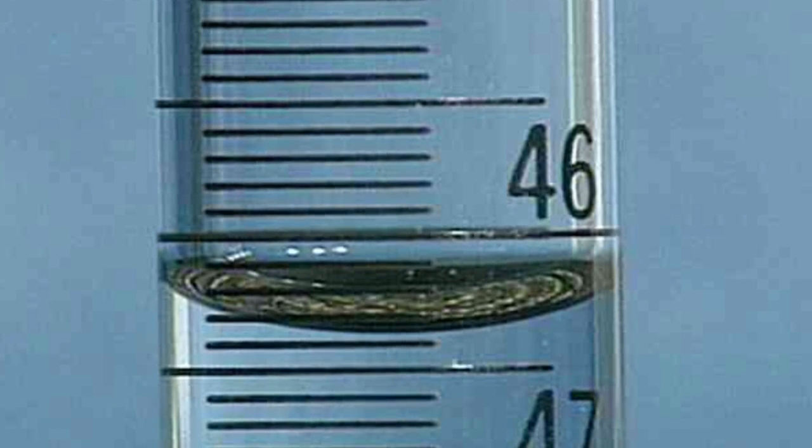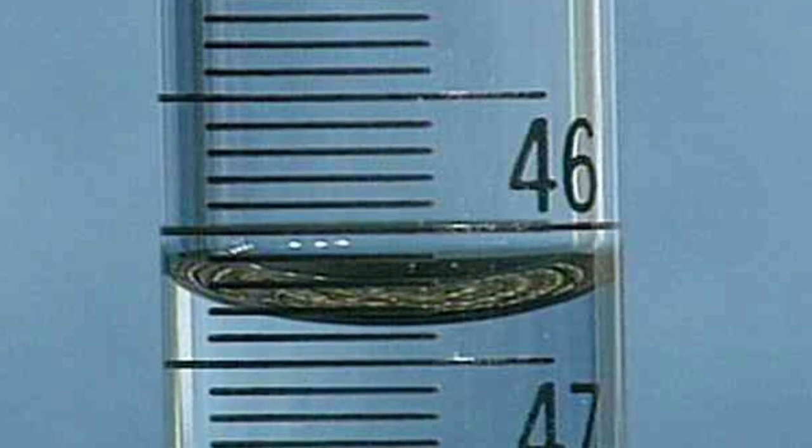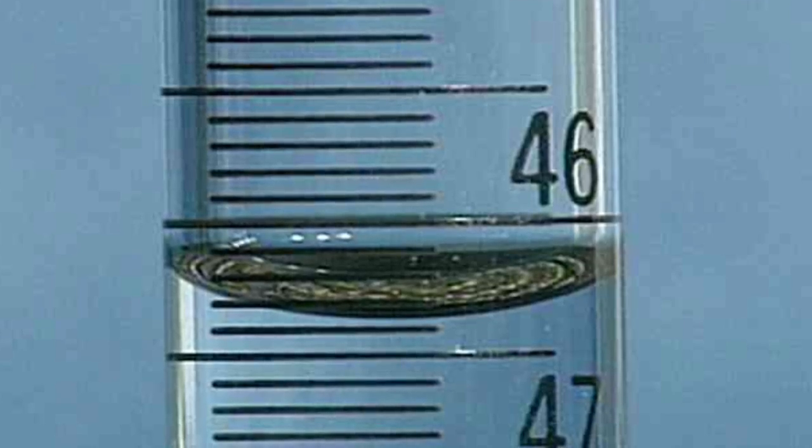To read the volume with a meniscus, one must read using the bottom of the meniscus. Always estimate one past the last graduation on the cylinder.